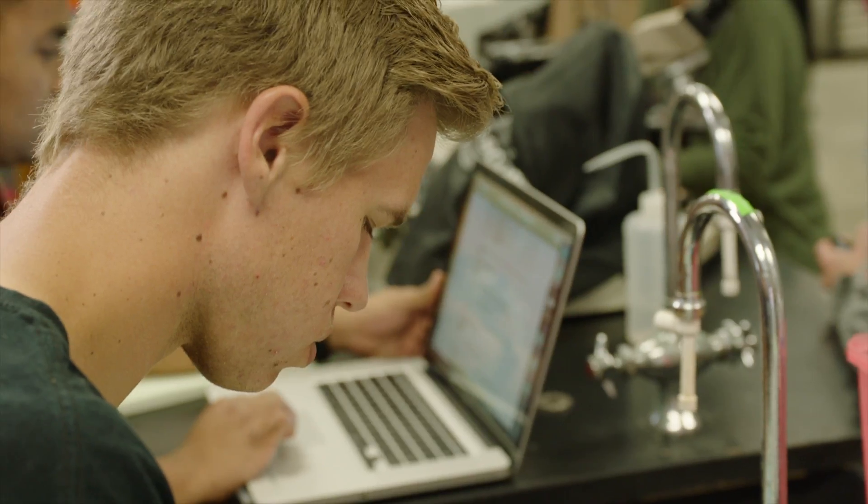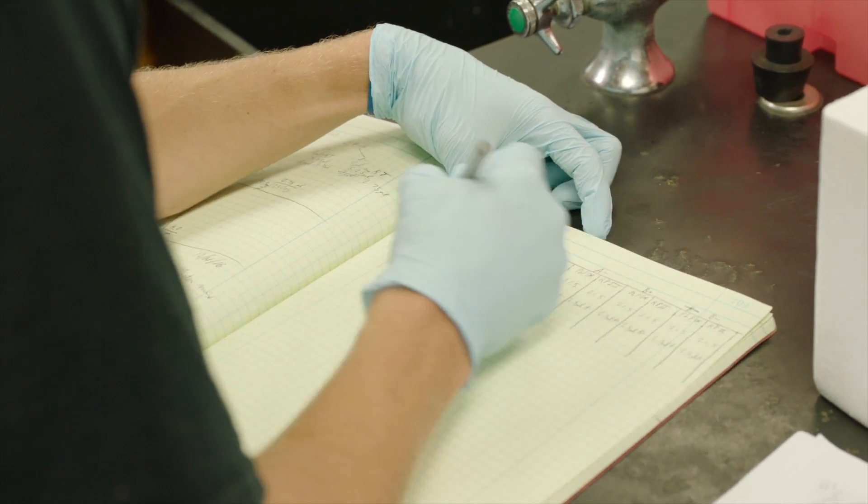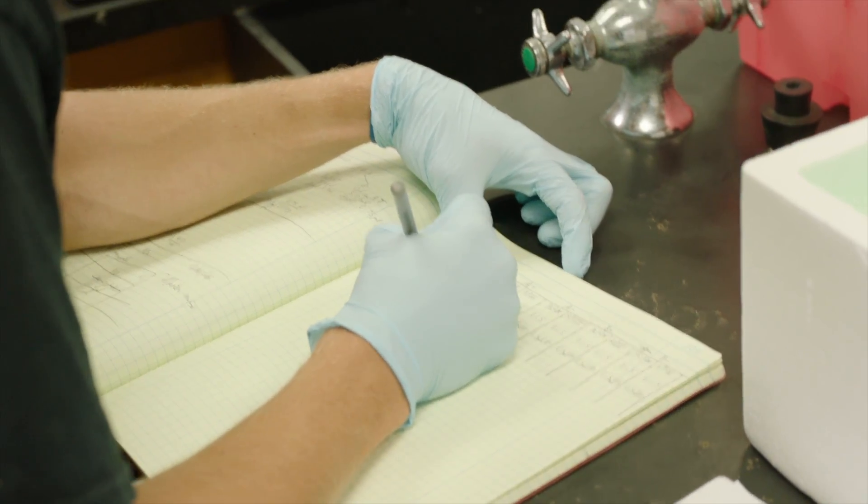The MiniSeq for me in undergraduate studies is huge, really. The ability to map out the genome and the expression of two different behaving species.